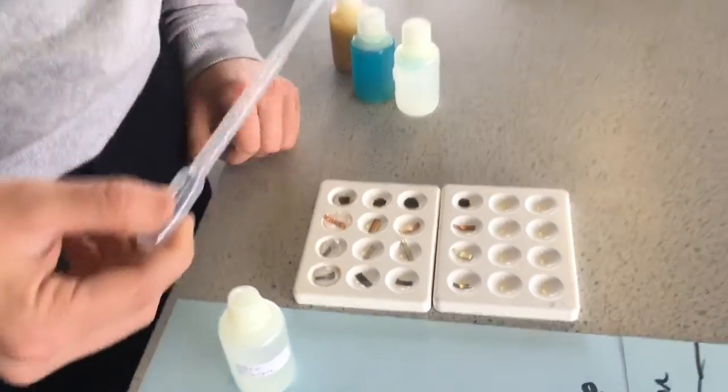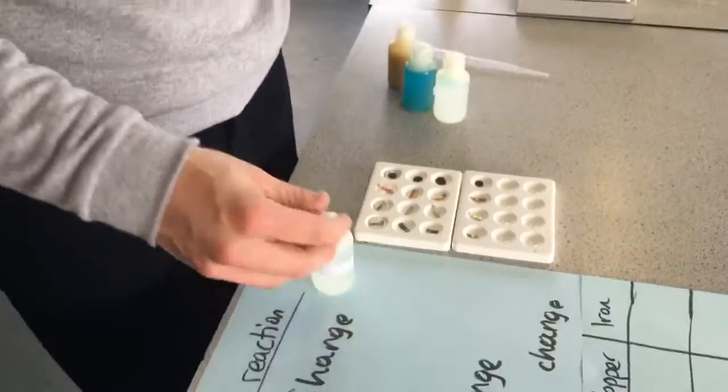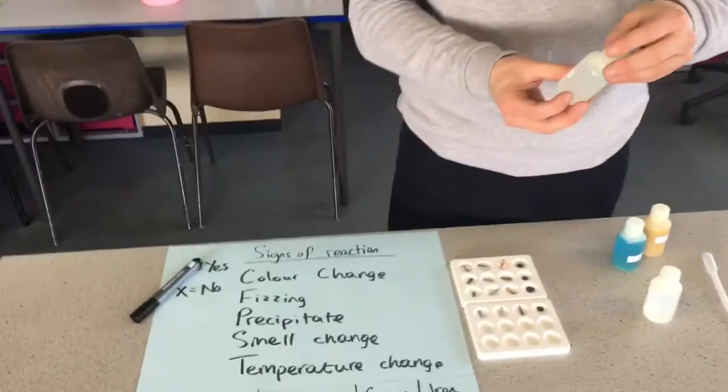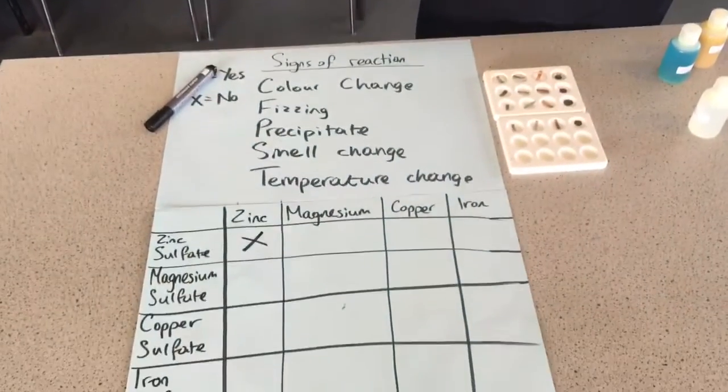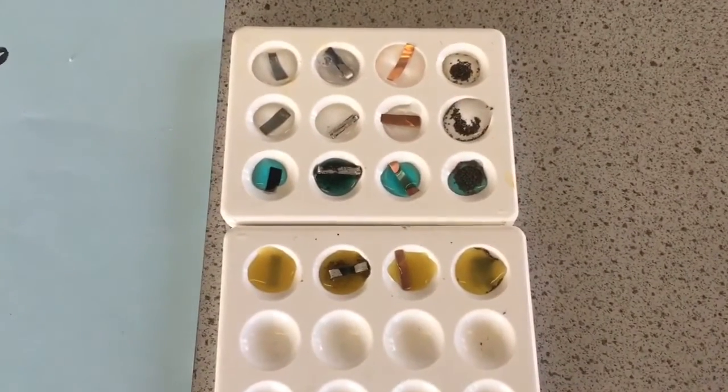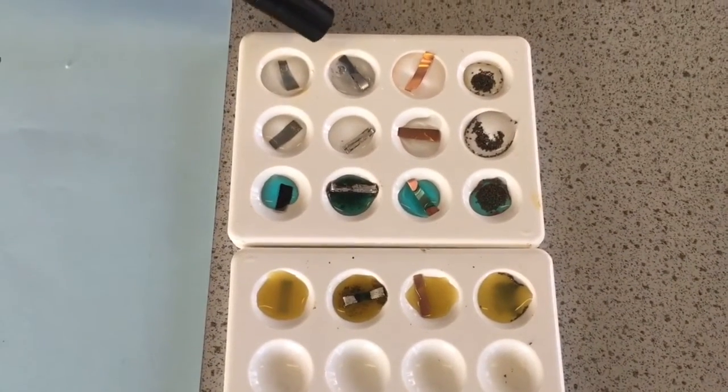Now, you've seen how we're going to carry this experiment out. What myself and Sir will do now is we'll do the experiment, show you the results at the end, and then we'll talk through them. First thing then in terms of these results we can focus upon is magnesium.